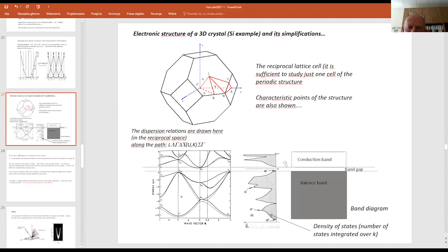So you get the density of states then, not this, because you have no energy dependence of your dispersion because it's averaged. But yes, it's possible to use photoemission spectroscopy for polycrystals. You can even measure it in the ARPES mode, but you're not going to see angular distributions, for obvious reasons, because you average over all angles.